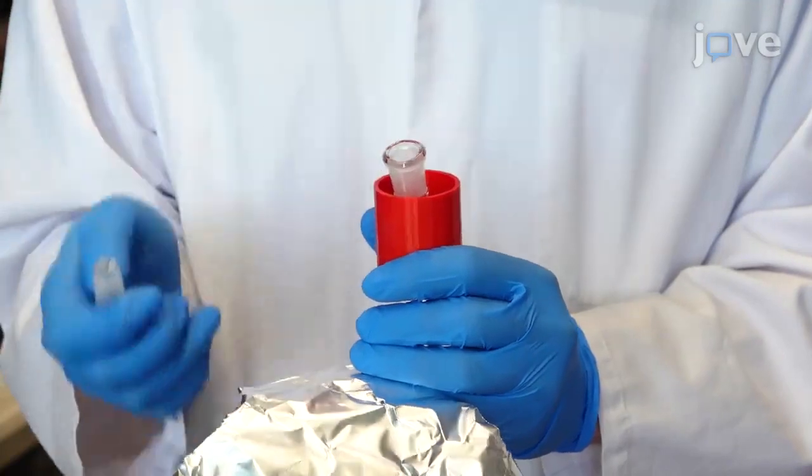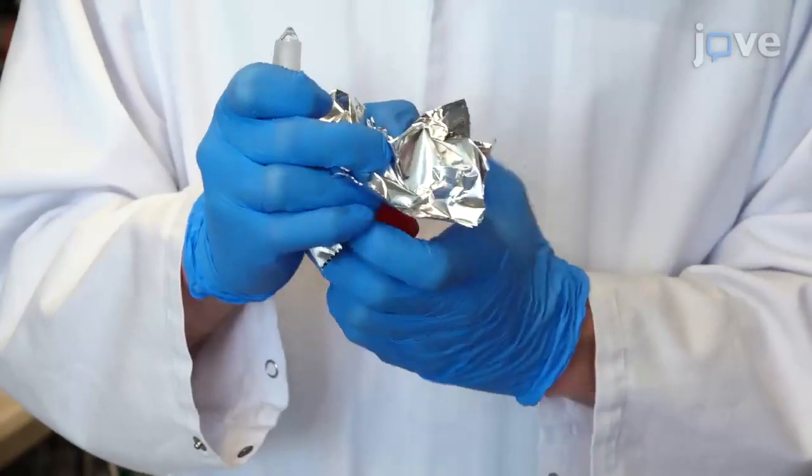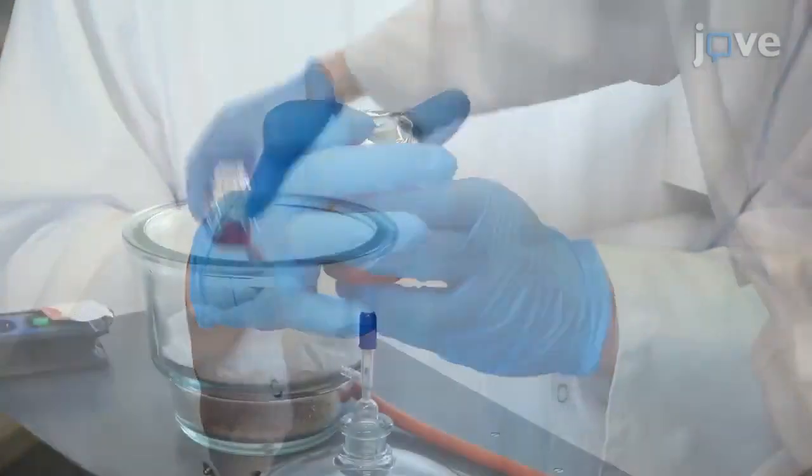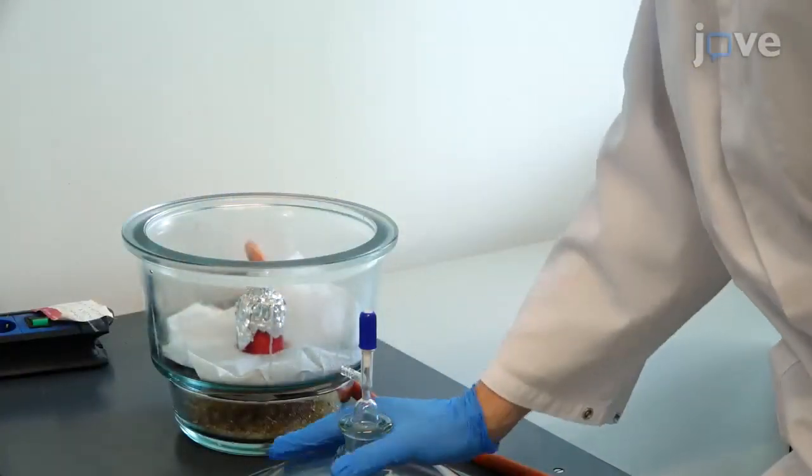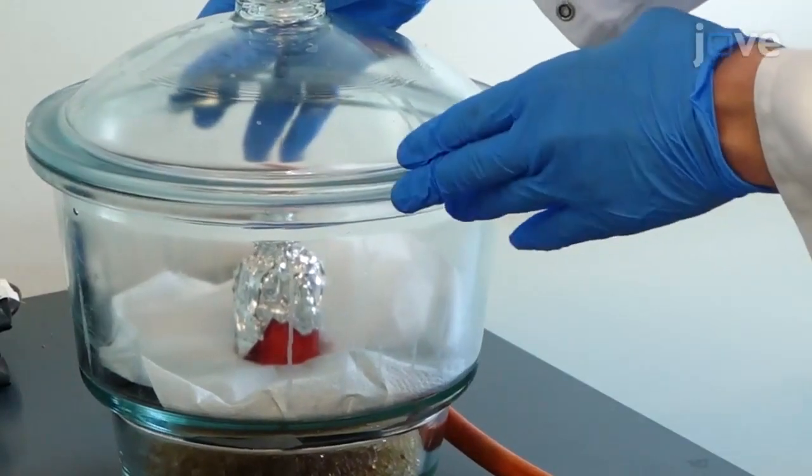After this, loosely wrap aluminum foil around the opening of the round bottom flask to prevent the loss of glass beads and place the flask into a desiccator for at least one hour to ensure that the remaining chloroform and methanol are evaporated.